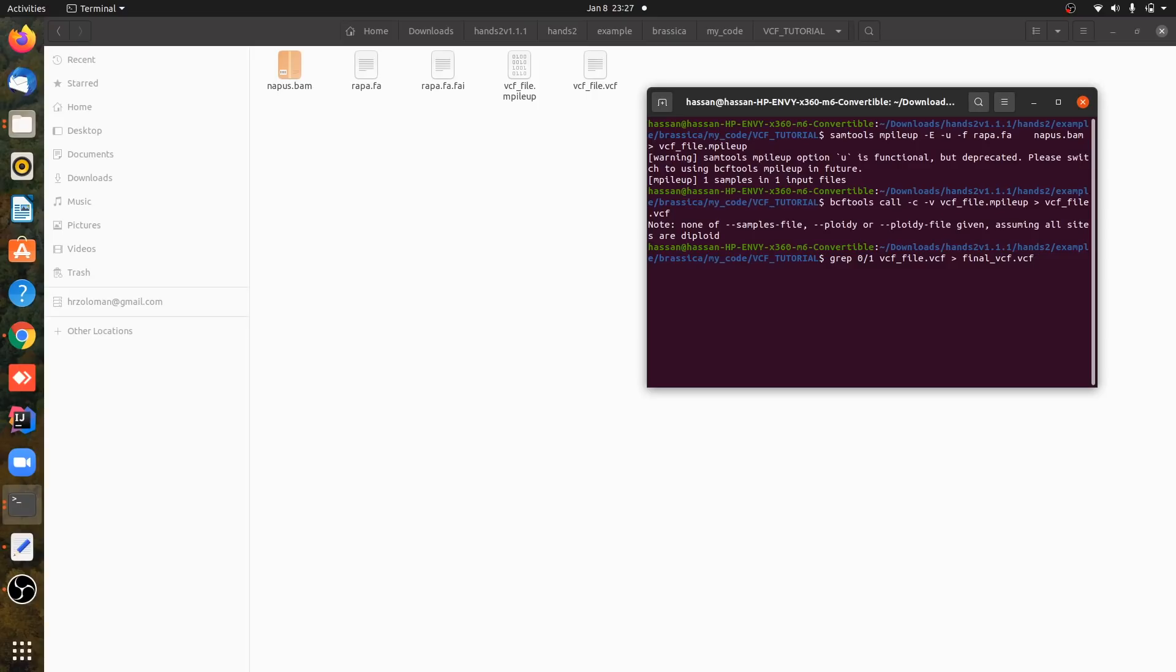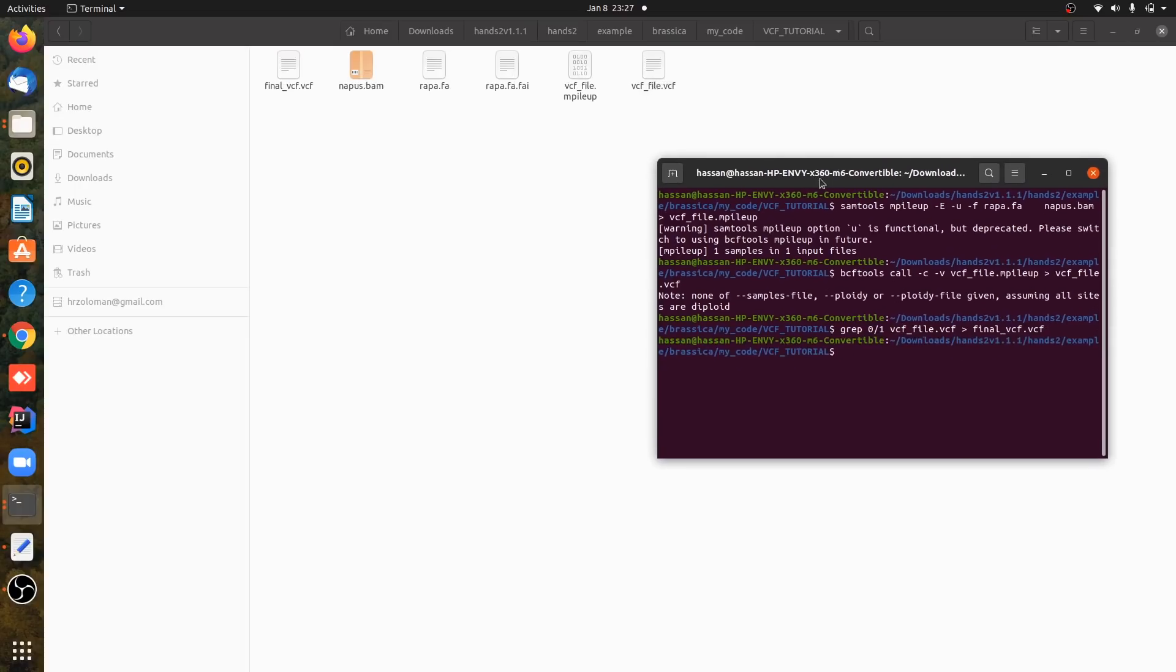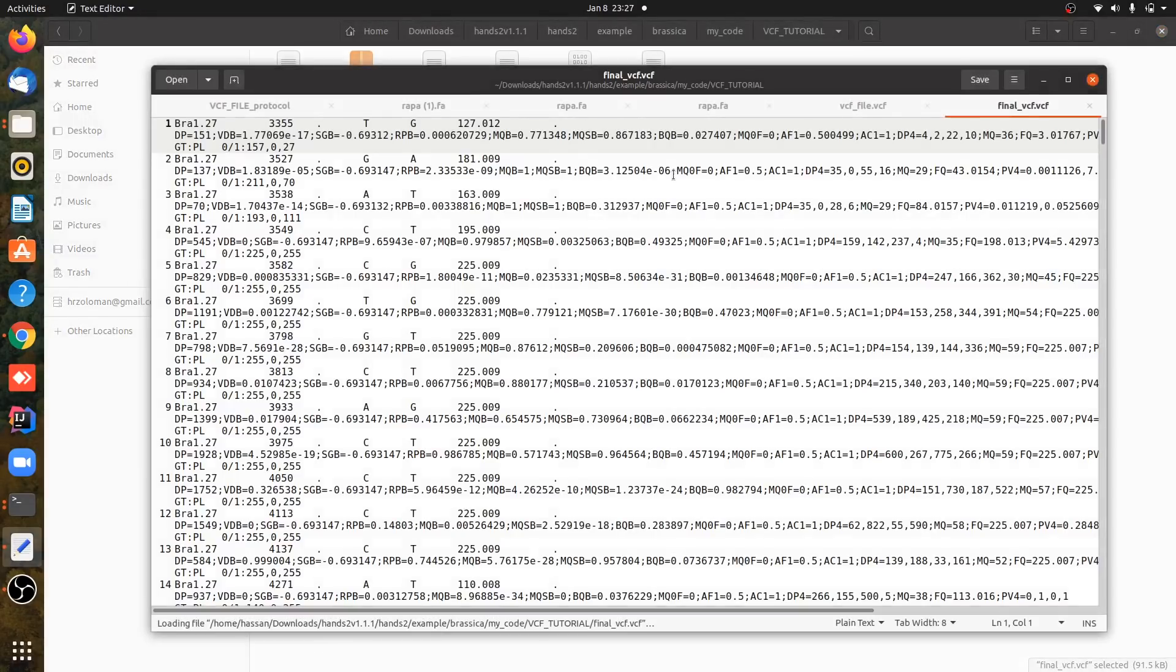Because the original VCF file will also contain homozygous positions, but we need heterozygous positions with 0 and 1. So here we have final VCF. This is our final VCF file, but as you can see there is no header.